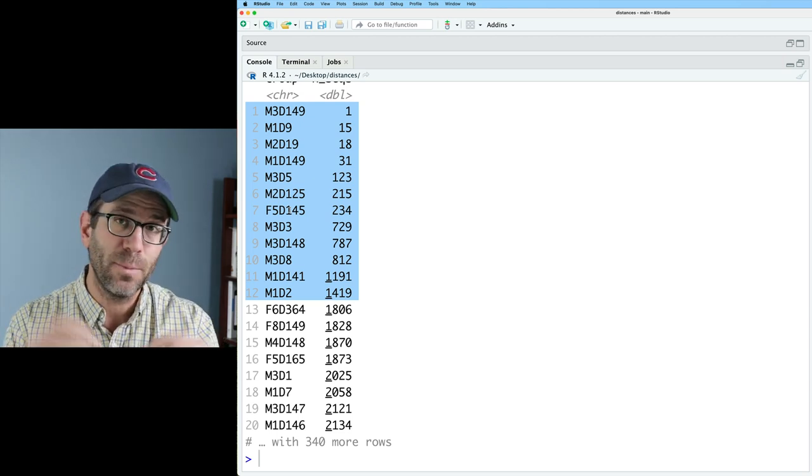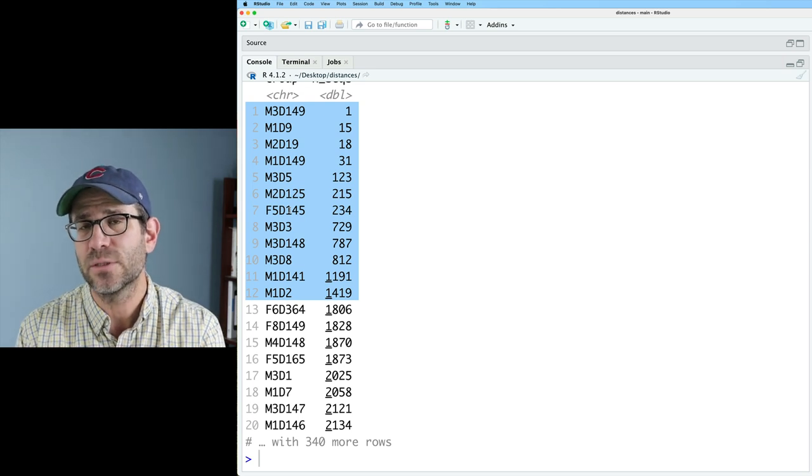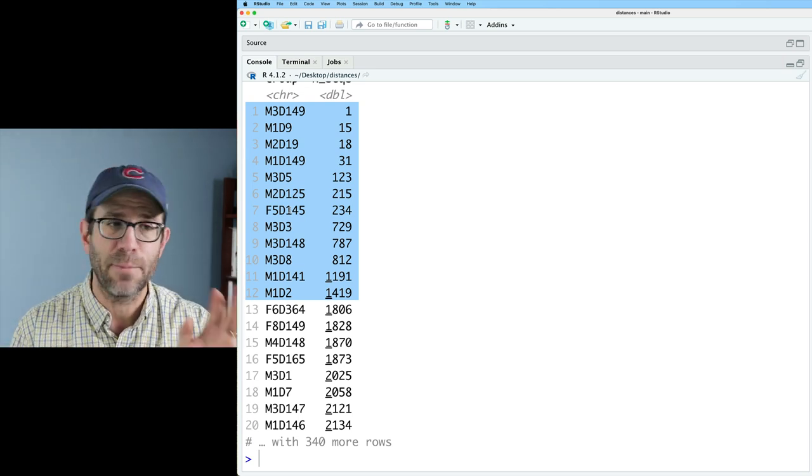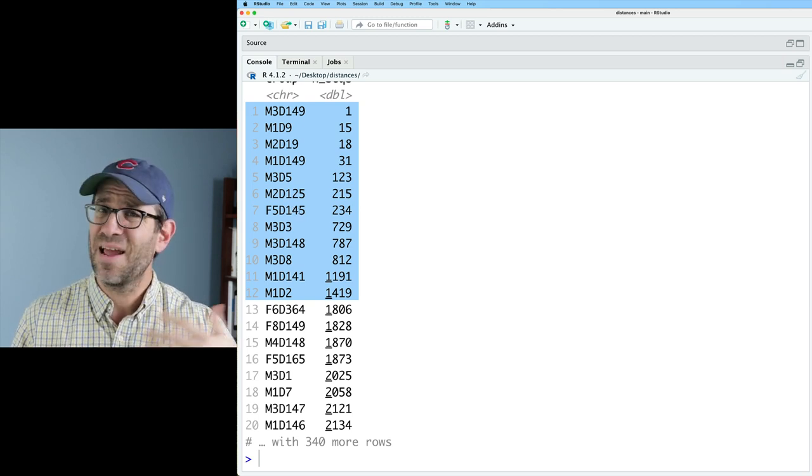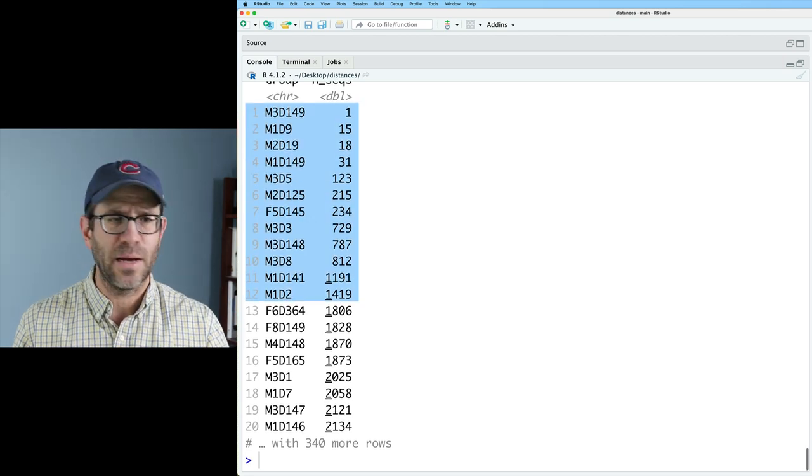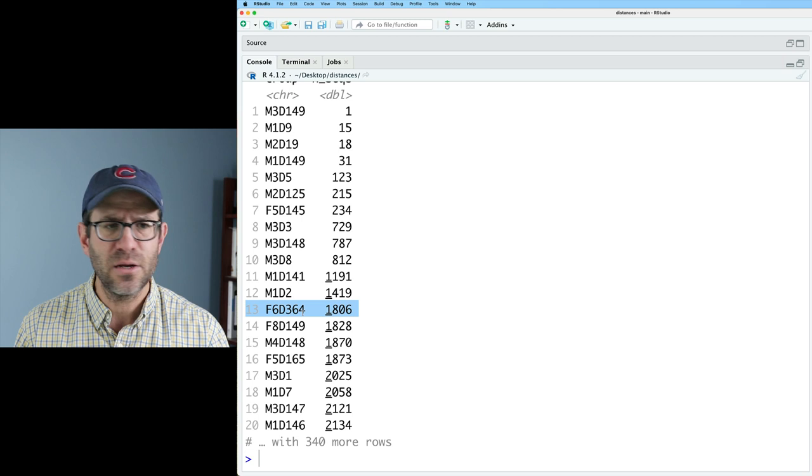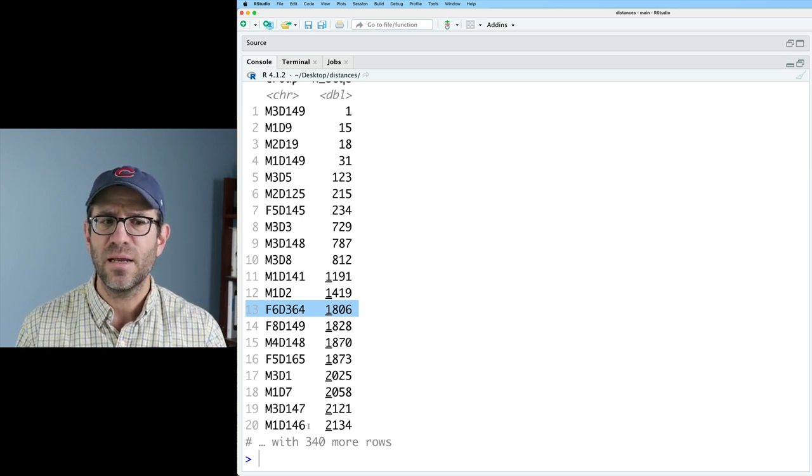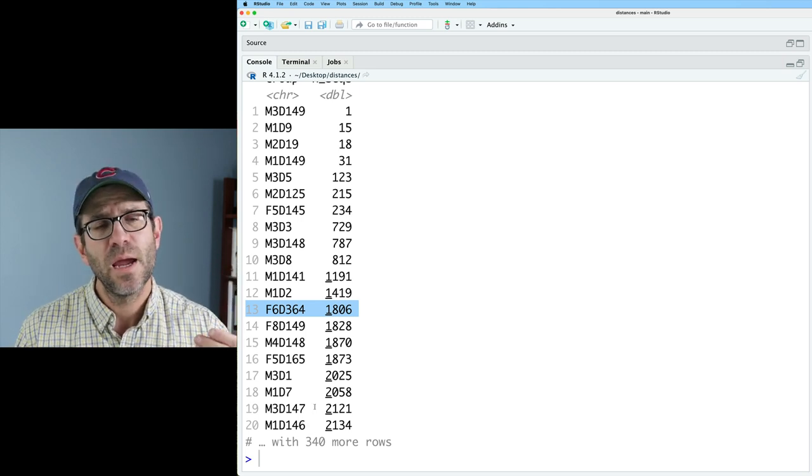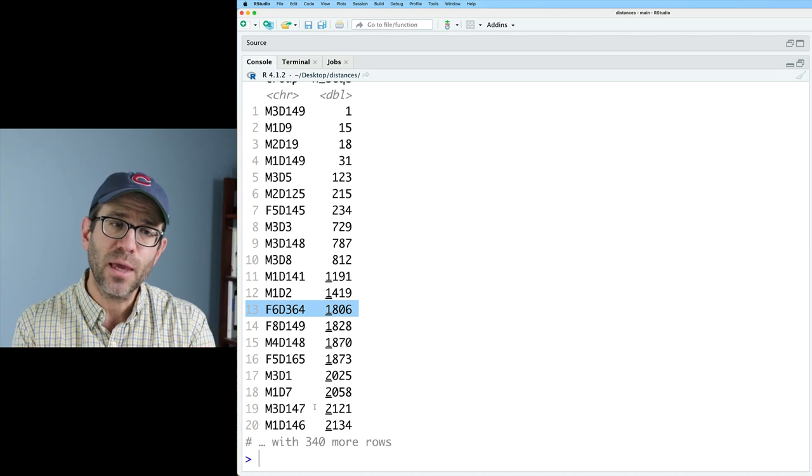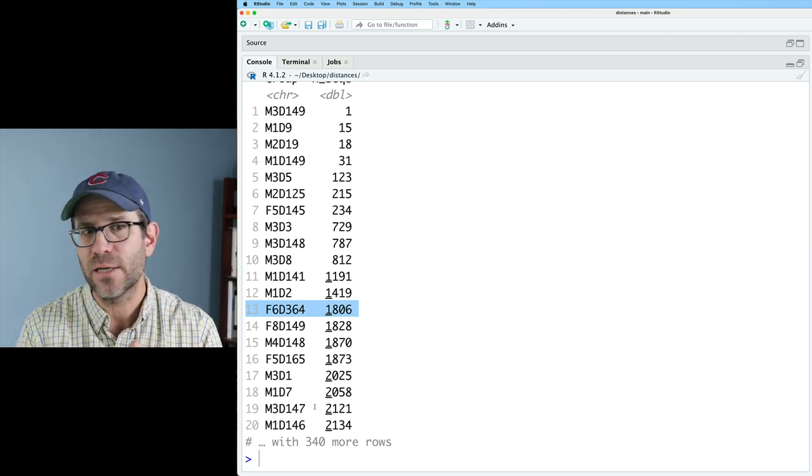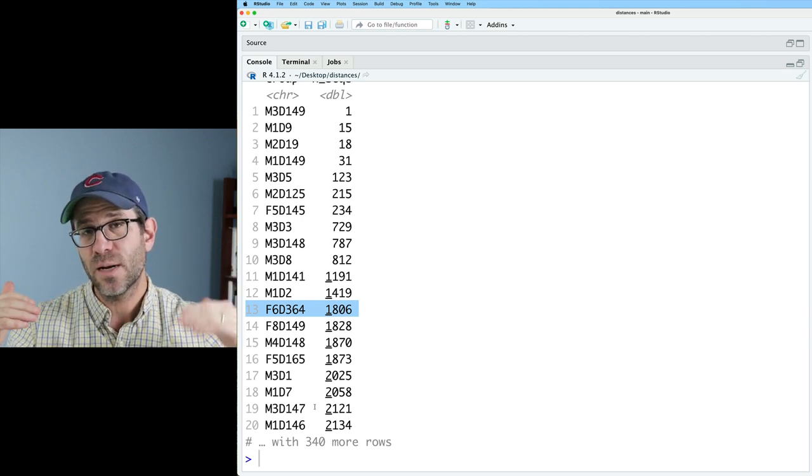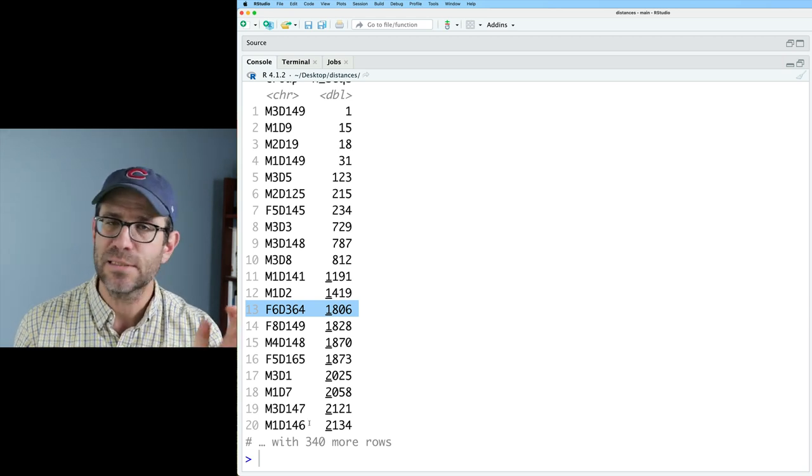So there's perhaps an equal number from male three. And that's about half the samples from those animals. And so I'd have to kind of come to terms with whether or not I'm willing to sacrifice that many samples from those animals. Perhaps something happened when we pulled the samples together before we sequenced, and we'd like to go back and re-sequence those samples so that we can get a larger sequencing depth for those samples. That's certainly something you could do. You could also just say, meh, I don't care. You could also say these are a lot of samples I don't care about. And frankly, I set this threshold of 1800, but maybe I don't care about some of these other samples either. And maybe I'd be willing to go up to 3000. And so I feel like finding the breaking point is a starting point for thinking about what samples are you losing and gaining by setting that threshold.